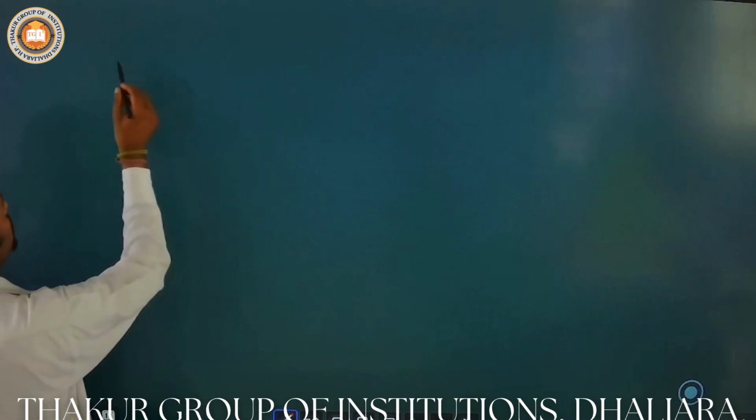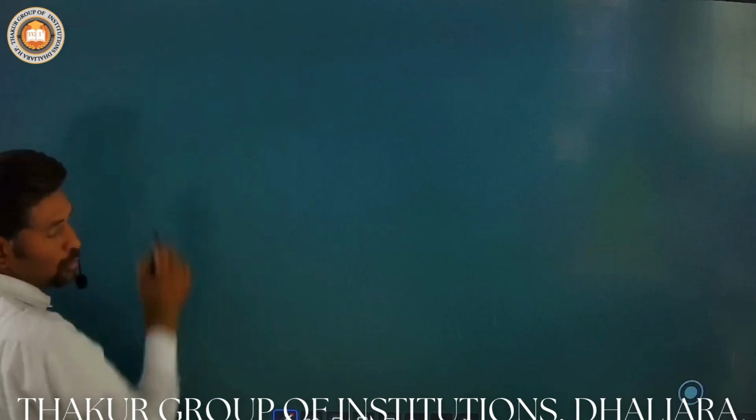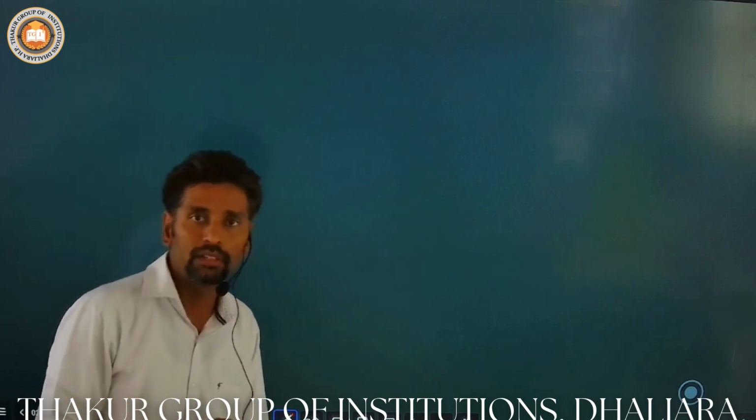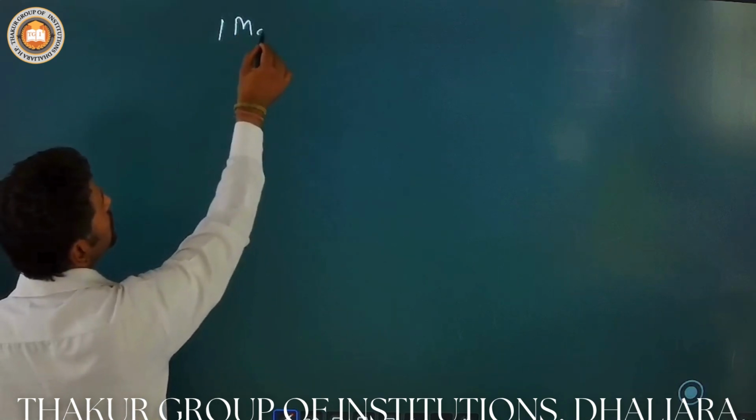Now focus on the preparation of the solution. Let us first discuss the molar solution. If anyone wants to prepare a molar solution, let's consider I am going to discuss a 1 molar solution.